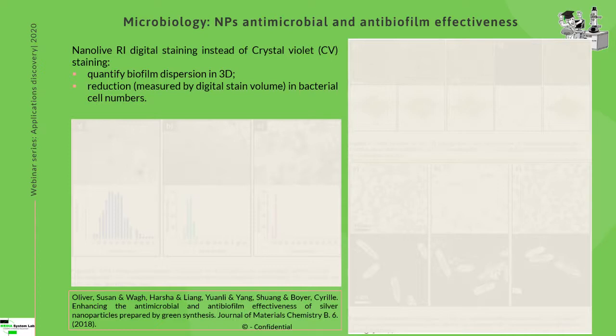So you can start to see the bacteria and the nanoparticles sticking on the wall and destroying the wall of these bacteria, inducing the explosion. So excellent. We have also this. So we select correctly the nanoparticles. We know that the nanoparticles are killing bacteria, but how many of them are going to be killed? So in this case, we have the first application of holotomography. You can simply make an acquisition in a field of view where you have nanoparticles and bacteria, and thanks to the pseudocolors, you can check the surfaces, and instantly all the bacteria will be marked with your pseudocolors.